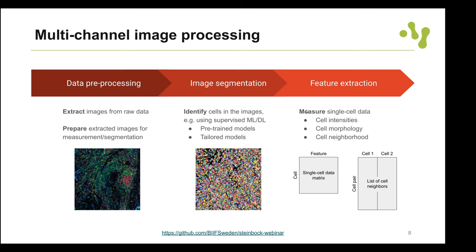We did the pre-processing — extracted TIFF images from raw data with hot pixel filtering. The next step is segmentation. This is probably where most time savings are achieved when using Steinbock, because if you use a pre-trained neural network such as the Mesmer neural network by Greenwald et al., this is really just one command: 'steinbock segment deepcell'.